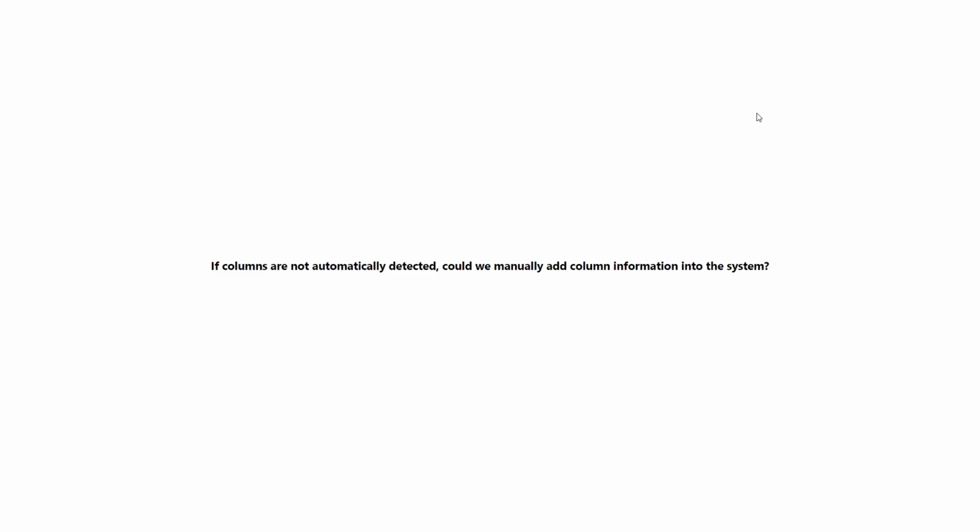Absolutely. There are already 2 default fields that are built into the sample set method in Empower. And one is the column name and one is the serial number. And the column name is actually a sample custom field with a list. So if you create a sample set method and you click in the first cell for that field, a list pops out. Now, of course, the list is all Waters columns, but you can change that. You can modify that. You can edit the list. You can either take away or add more columns to it.